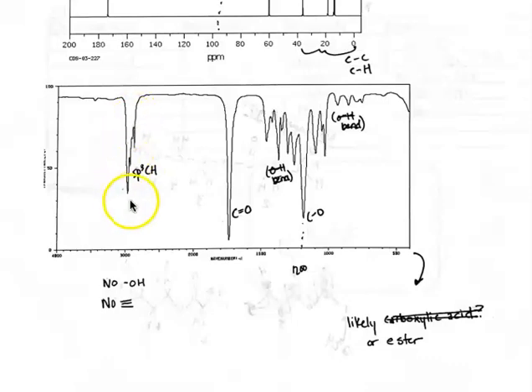So you can see here we have this tall peak and nothing past 3000, which is where we would get into the OH, the oxygen-hydrogen bonds. So we can go ahead and just immediately rule out any functional groups that contain an oxygen-hydrogen bond. Our next peak down we have at about 1700 inverse centimeters, which is going to be marking a double bonded carbon-oxygen. And then as we continue down, our next highest peak is this carbon-oxygen bond, which is around 1200.